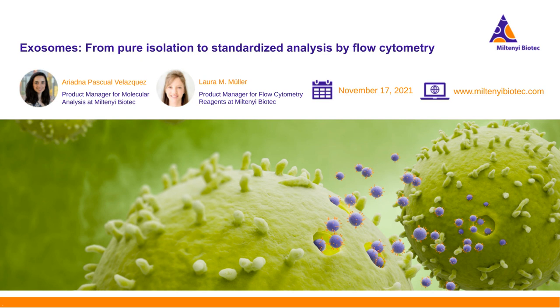So again, a very good question. As you have seen in the presentation, we are applying a kind of ELISA principle. If we have one capture antibody coupled to the beads, and then a second antibody carrying the label to label the bound vesicles, you only get a signal if both markers are present on the vesicles. So basically, we always detect the presence of two markers on the same vesicle to get the signal.